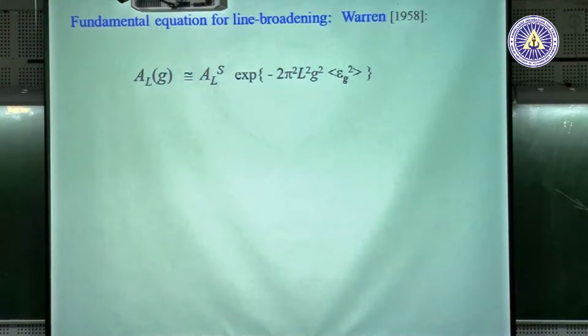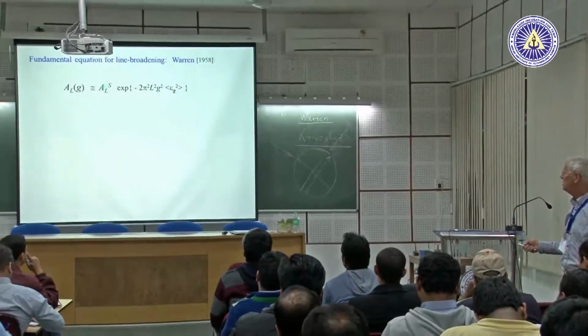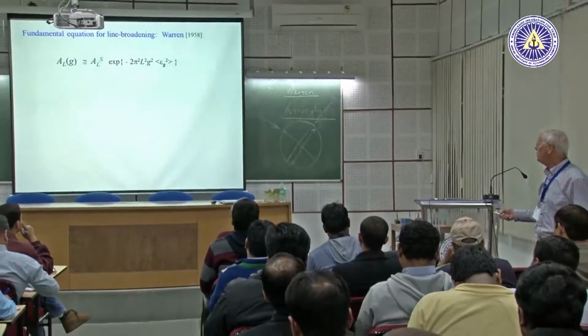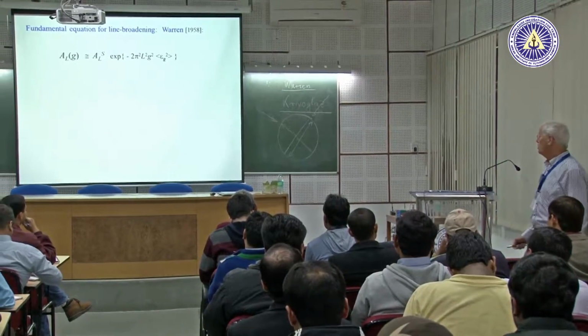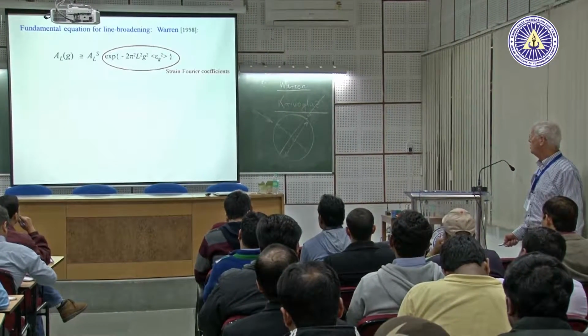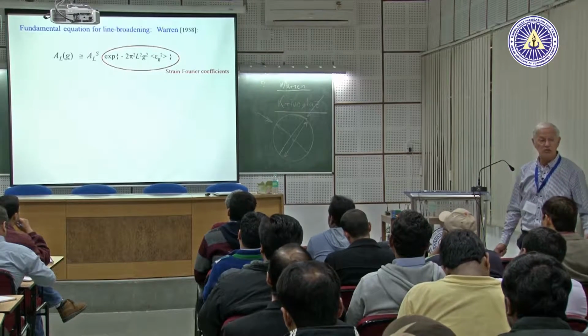And now we have to say what is the correlation between the mean square strain and the lattice defects. Okay? Only the strain type lattice defects, because the size is extracted in terms of a separate Fourier coefficient. Okay? Now, well, this is the strain Fourier coefficient. Okay, this exponential.